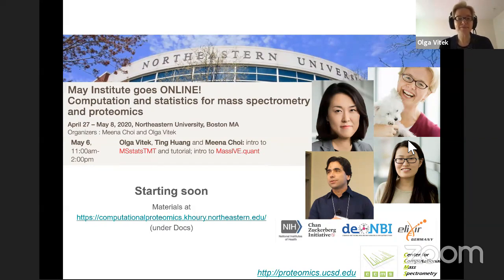So we have a very exciting program for today. We will have two parts of the conversation. The first part focuses on MassIVE.quant. It is a repository for storing, processing, reanalyzing data from quantitative mass spectrometry-based proteomic experiments. And then the second part, we will talk about an extension to MSStats, MSStats-TMT, which is designed specifically for work with TMT labeled data.